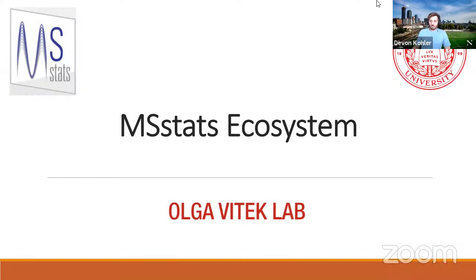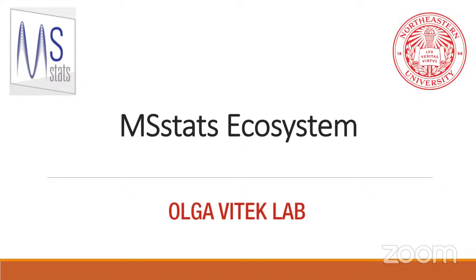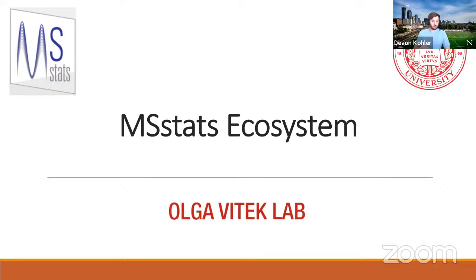Okay, hopefully everyone can see my screen. Like Olga mentioned, I'm going to go over the MSstats ecosystem today, just go over what packages are available, how you can use them, and then their current status and what we're developing and what you can expect in the future. So first, I'm just going to go over the team so you can get a face to everybody who's developing everything.